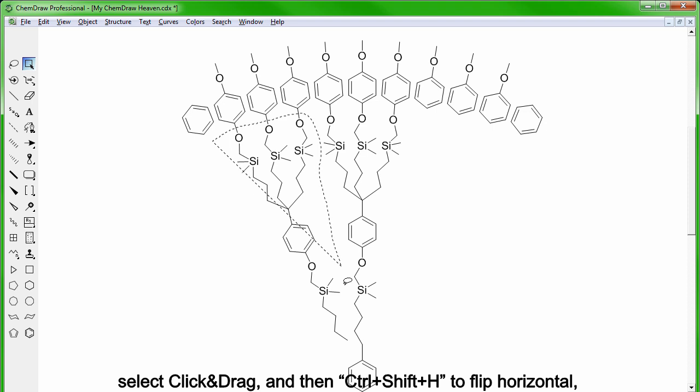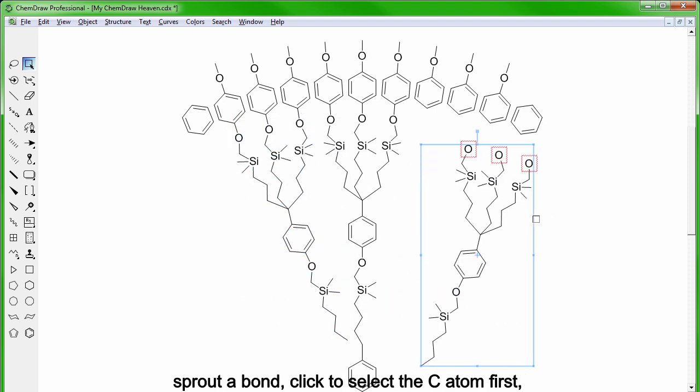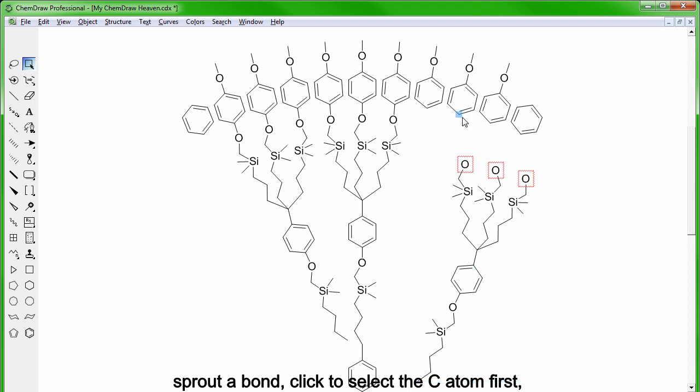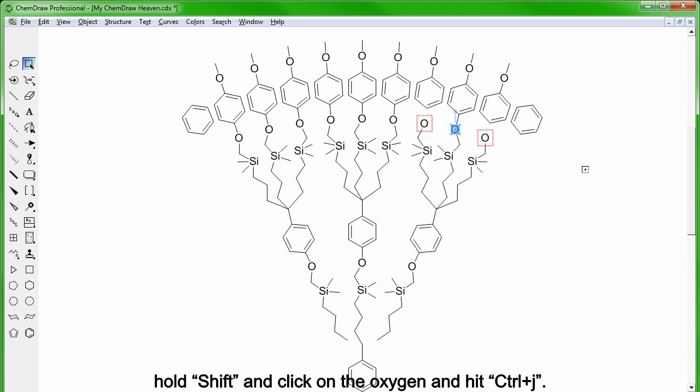Select, click and drag, then CTRL-SHIFT-H to flip horizontal, sprout a bond, click to select the carbon atom first, hold SHIFT and click on the oxygen and then hit CTRL-J. Once that is done, again sprout some bonds by pressing 0 and then stitch the bottom parts together.